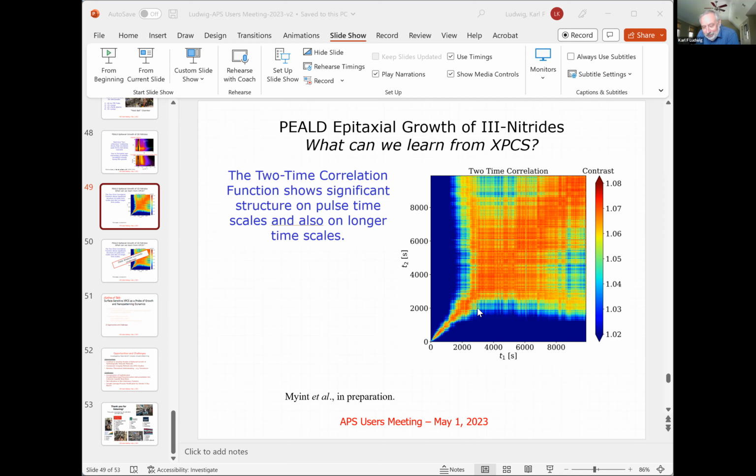We had done some work with martensitic alloys years ago in which you saw a very blocky behavior associated with stress relief events during the martensitic transformation. We would like to be able to argue that they're a little bit less important as time goes on, but you can see it's complicated.